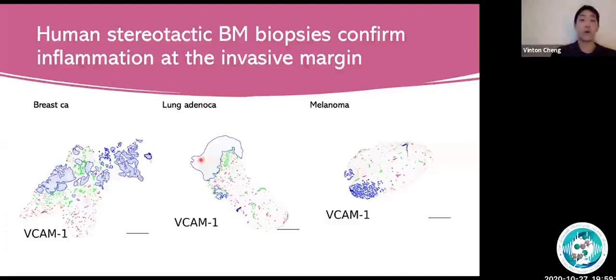And the problem is if we allowed these tumors to grow and they had multiple tumors in the brain, then eventually they will grow so large that it will cause harm to the animal. Also we were interested in just one tumor rather than multiple tumors. And it's harder to control how many tumors you get and where they grow in the intracardiac model compared to the intracerebral model. So it just gave us a little bit more experimental control.